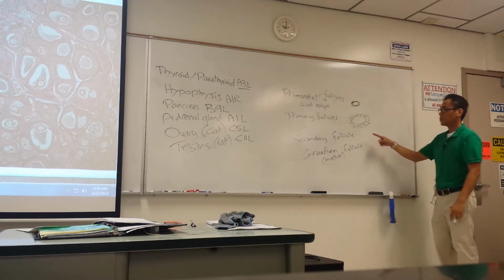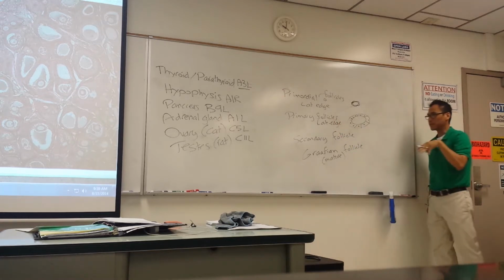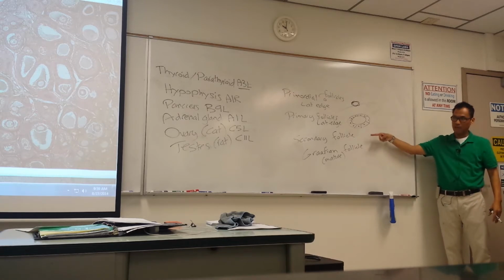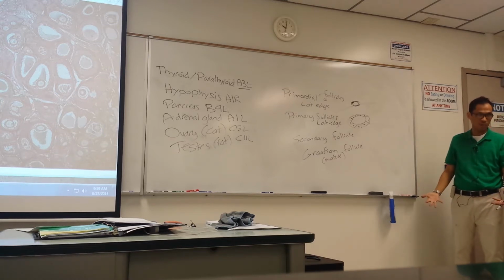They're just huge, okay? So these two, look for them at the edge. What happens is, the more mature ones that are selected for an ovarian cycle to reach secondary stage are pushed more towards the middle. So that big stuff in the middle, those are the bigger follicles.